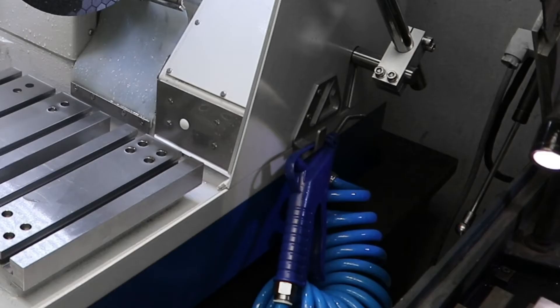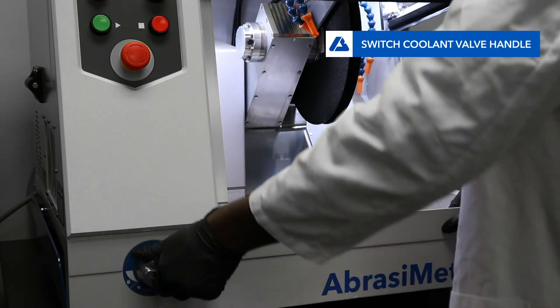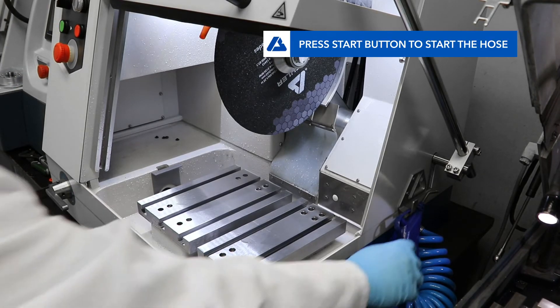The Abrasement M comes equipped with a spray hose for cleaning the chamber, located on the right side of the machine. To activate the hose, turn the coolant valve handle to point to the picture of the spray hose, then press the green start button.